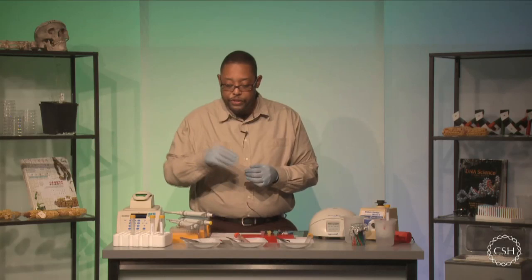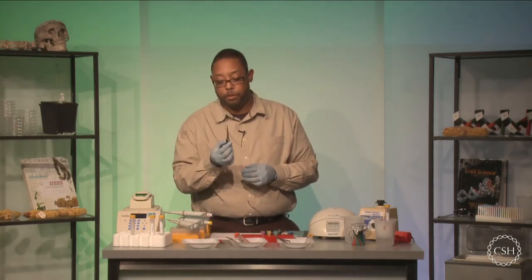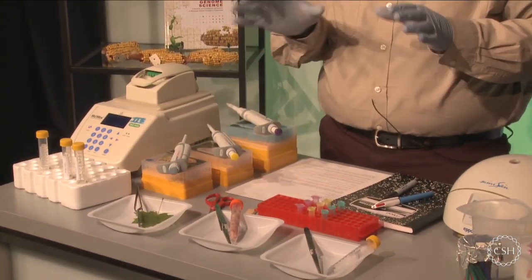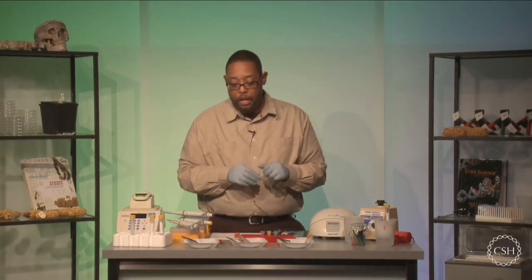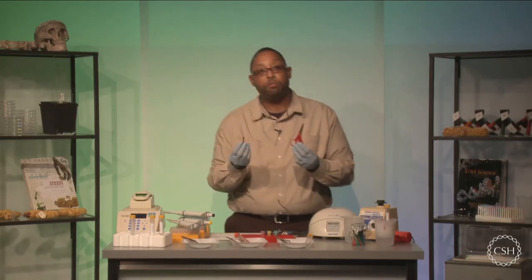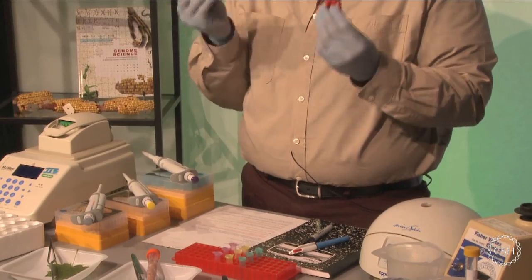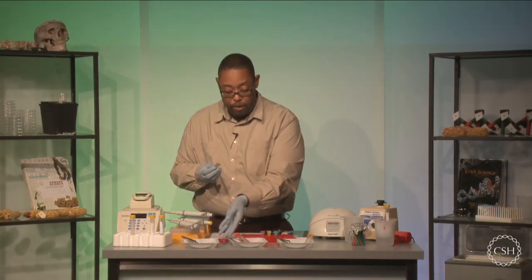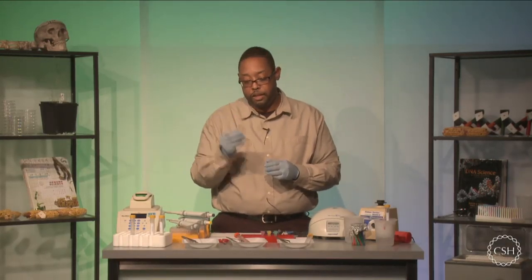So make sure you have that available to you. All right. You're going to see that we need some forceps, and for each sample, I recommend having a clean set of forceps. Okay. You don't want to have any cross-contamination in the experiment. So please make sure all these utensils are washed and autoclaved before you get started. Okay. You will also need a pair of scissors or maybe even a razor blade. This will allow you to cut tissue or separate tissue very cleanly, but make sure that these also as well are cleaned very well, either bleached or soaked in something that's going to remove any residual DNA that's essentially there.